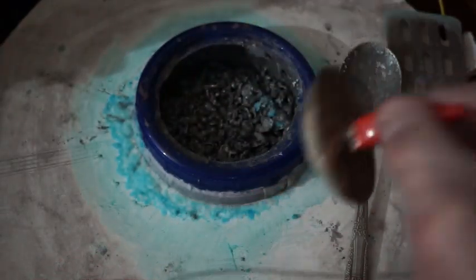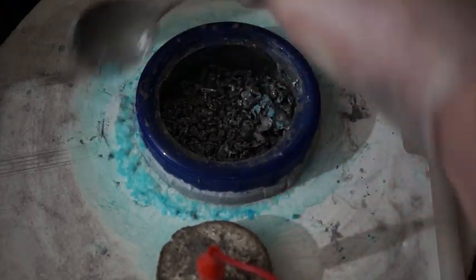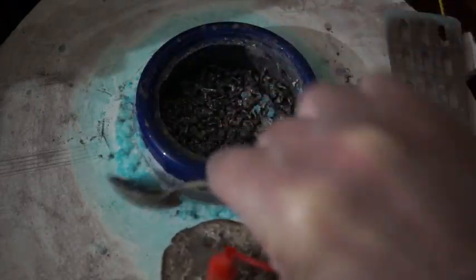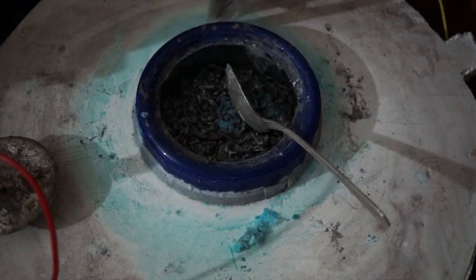Let's take a look at the silver cell. I've put about 2,000 grams into it over the last week. Let me just clean up this silver nitrate.